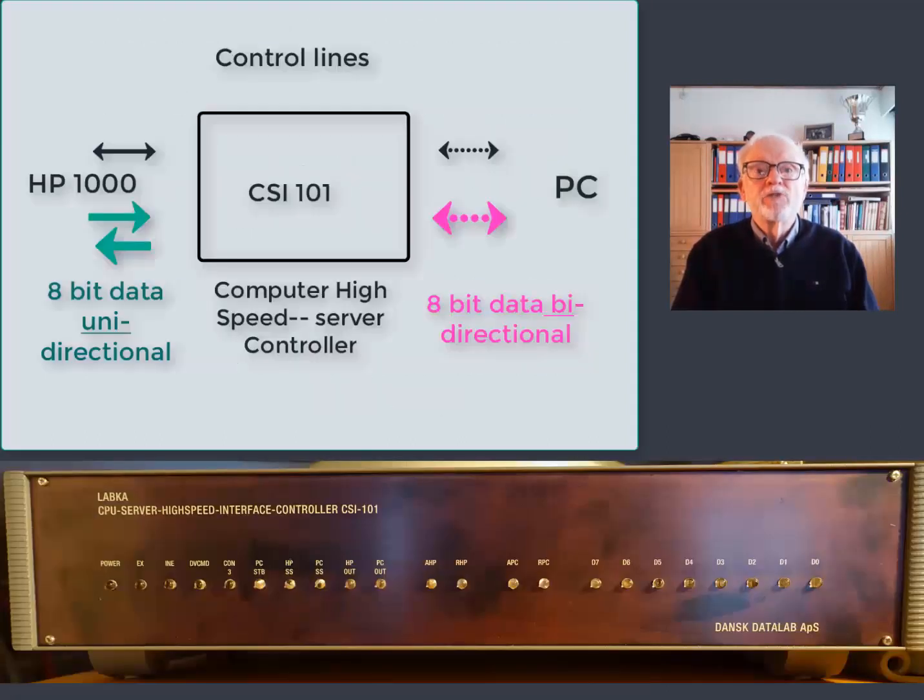Data is transferred in blocks. The transmission direction is often changed after each byte block that is transferred. A block of bytes will normally be from 32 bytes to approximately 4 kilobytes. For example, approximately 1 kilobyte for transfer of a block containing a requisition record with 10 result records, corresponding to a column in the cumulated response system.